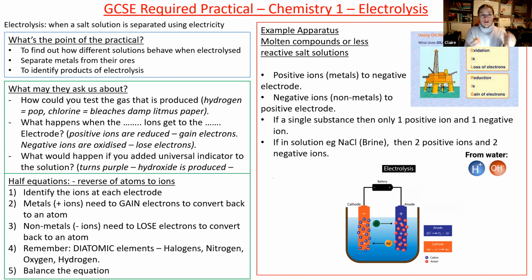If you stick 2 electrodes into table salt, the electricity will not pass through, the bulb will not come on. If you dissolve salt into water and make a solution, the ions are then mobile, moving around in the water, and that enables electricity to pass through, and the bulb comes on. So remember, if it's solid, it will not conduct electricity because there are no mobile ions.